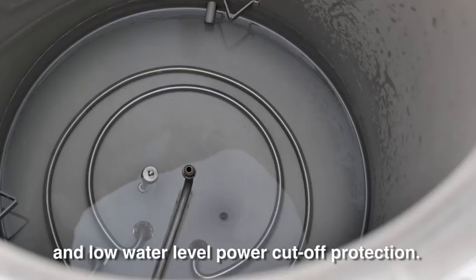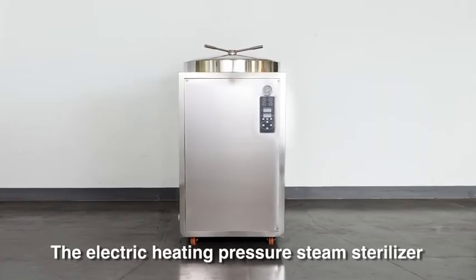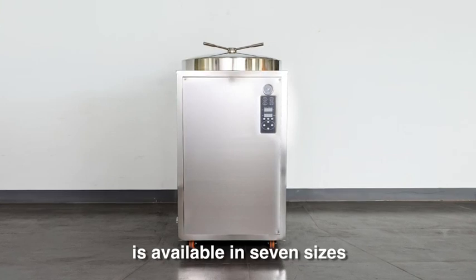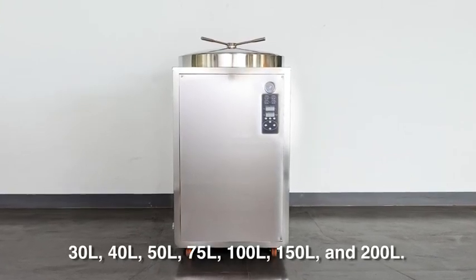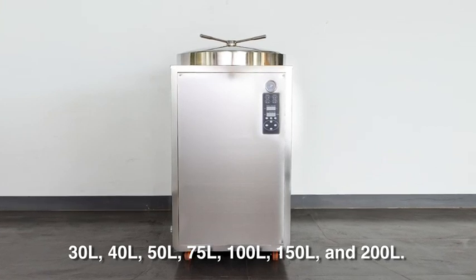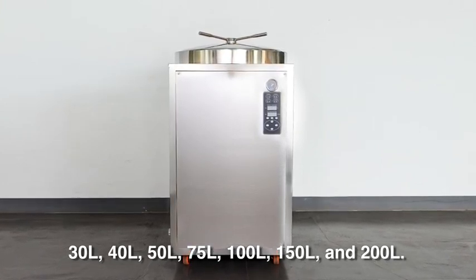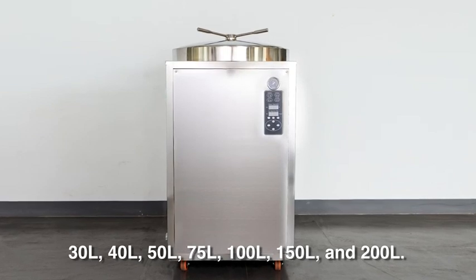It includes low water level power cut-off protection. The Electric Heating Pressure Steam Sterilizer is available in 7 sizes: 30L, 40L, 50L, 75L, 100L, 150L, and 200L.